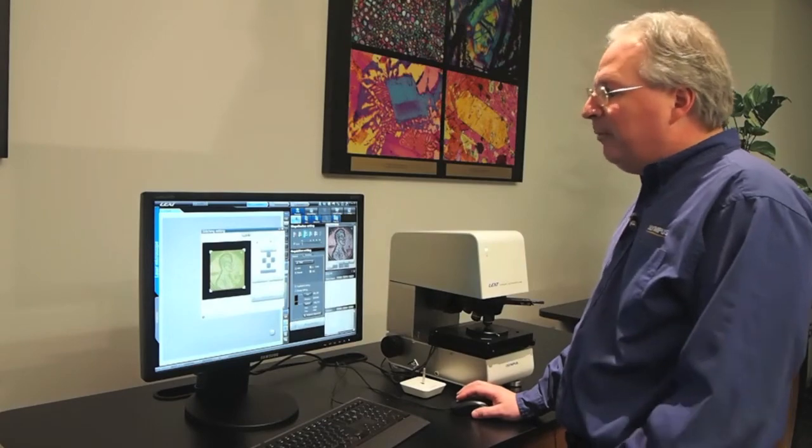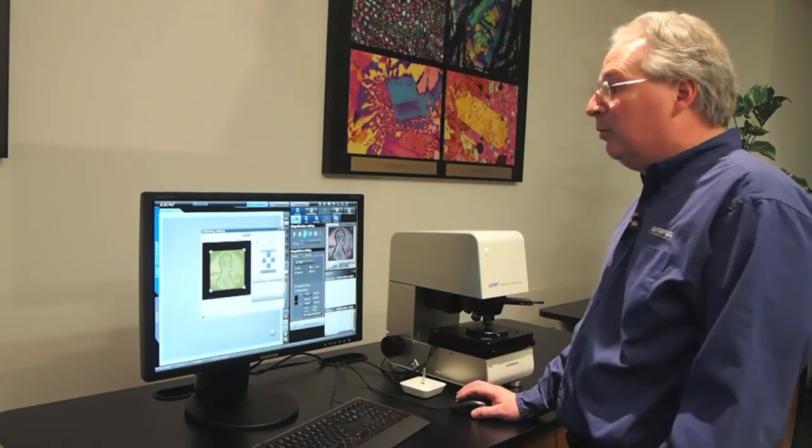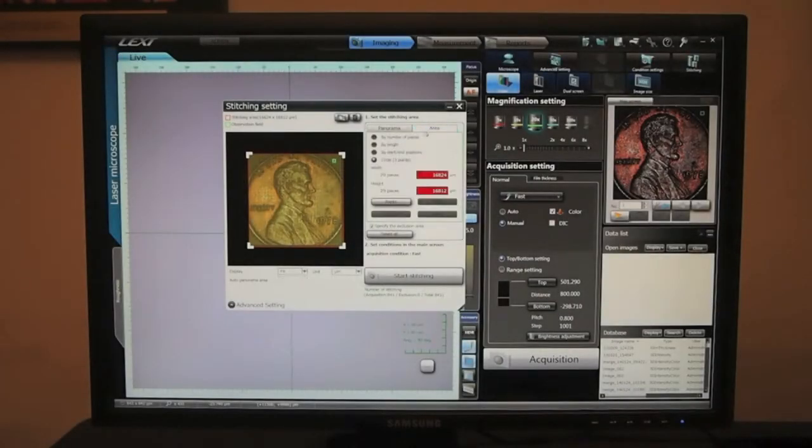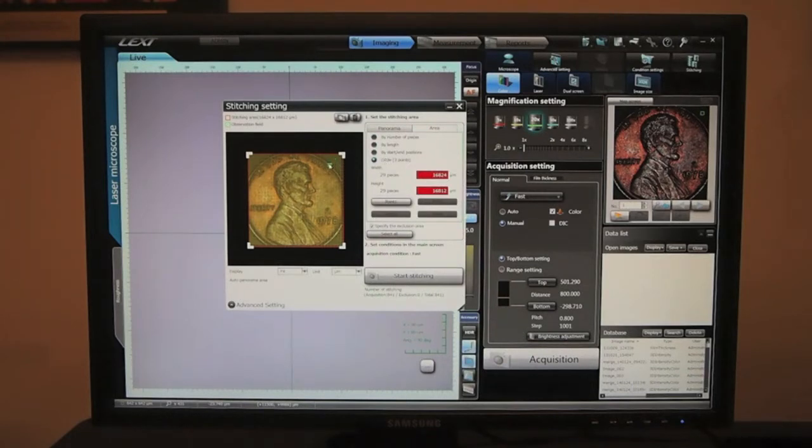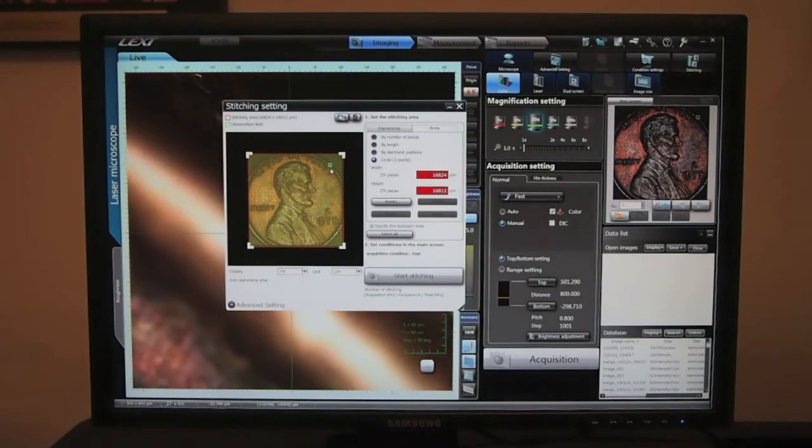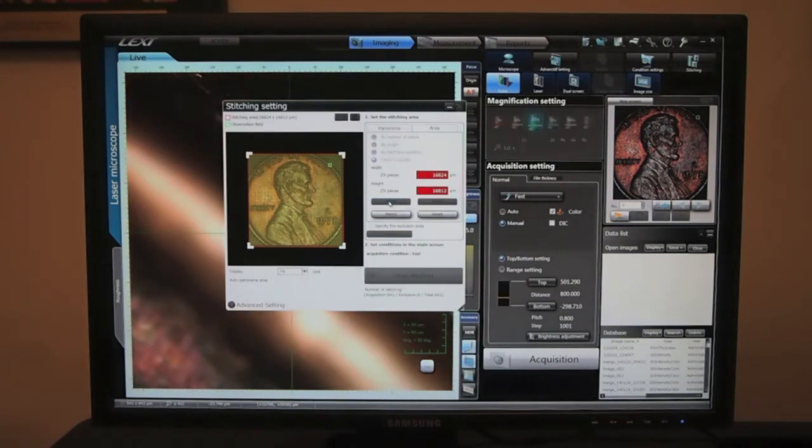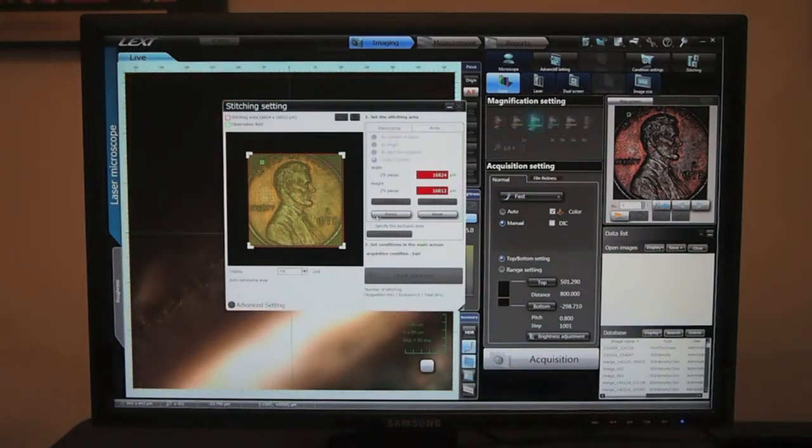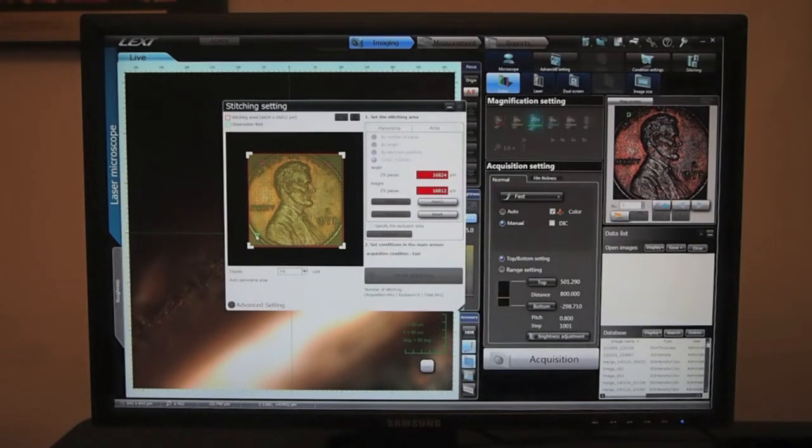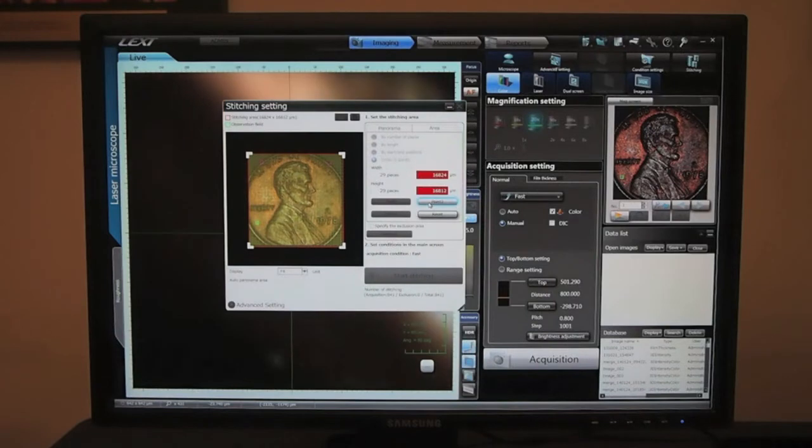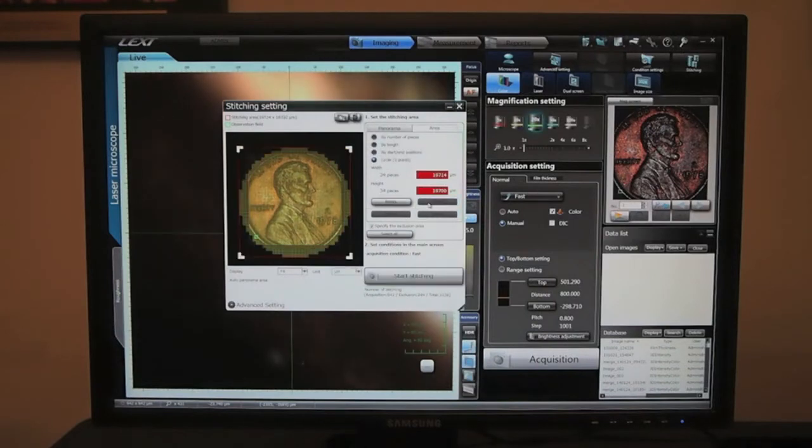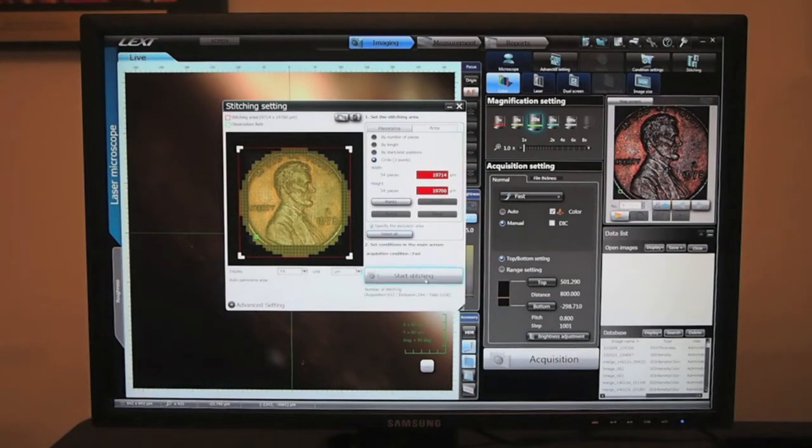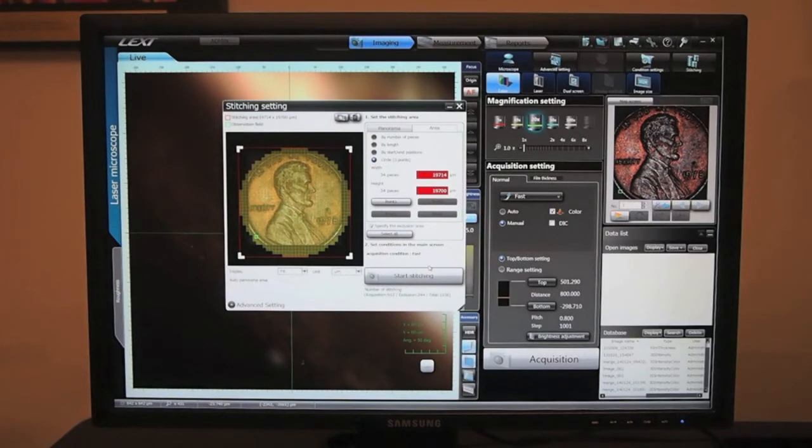Let's capture this round surface using the three-point circle. We'll select our first point on the penny, our second point, and our third location. Now we can see we're getting that circle, so we'll get all the detail in the penny without any extra space outside that's not required.